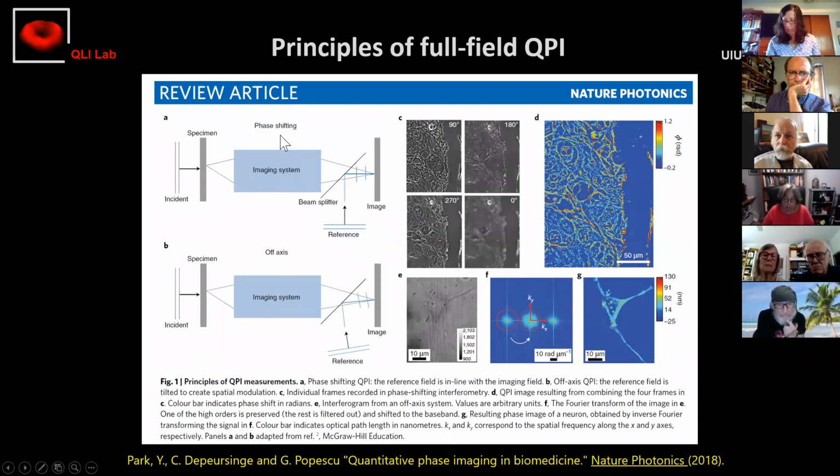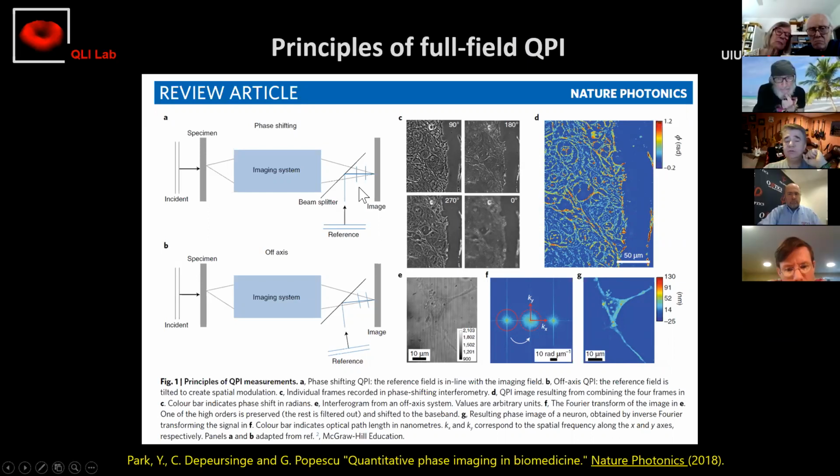So with this phase shifting method, what you can do is to add increments of pi over 2 here. So you convert those cosines into sines and so on. So you generate basically more data such that you are able to extract the phase uniquely. So you eliminate those amplitude unknowns, roughly speaking.